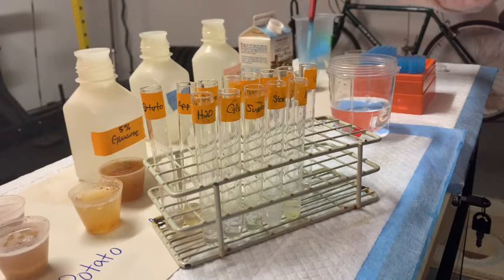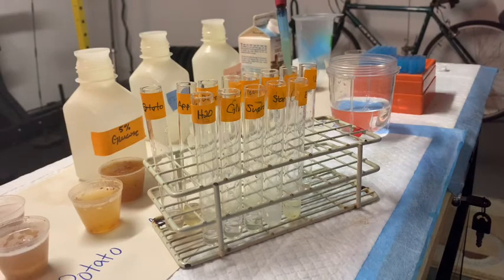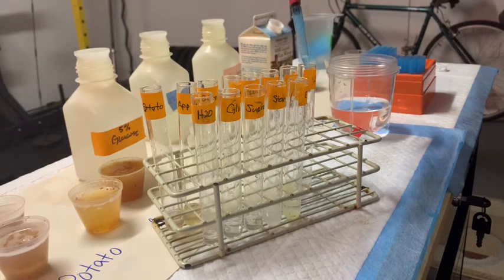We've got unknown number one, unknown number two, and unknown number three. So let's take stock of what we've done so far. We've added one mil of water to each test tube, and one mil of the correct positive and negative controls. The water is going to be our negative control. The egg whites are going to be our positive controls, and glucose, sucrose, and starch will likely be negative controls as well. Then we added one mil of our food juices to each test tube.